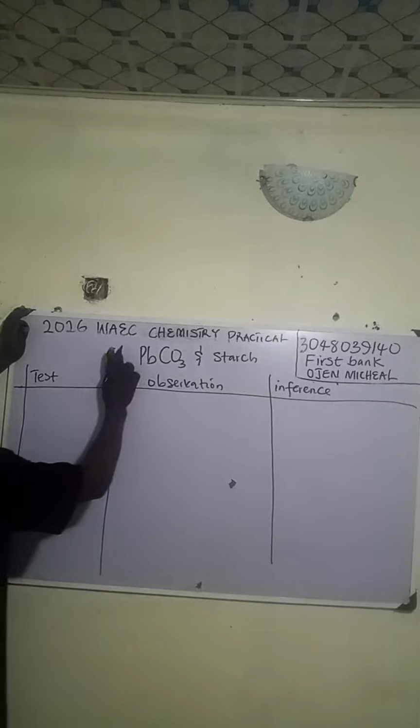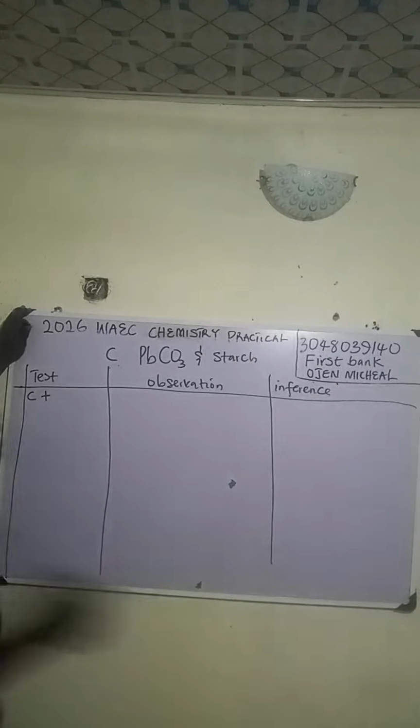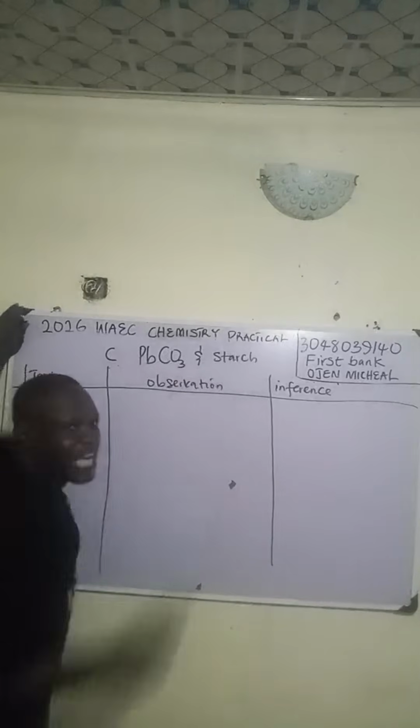So, having mixed this one now, firstly they will say C plus, remember, C is a mixture of lead(II) carbonate and starch.